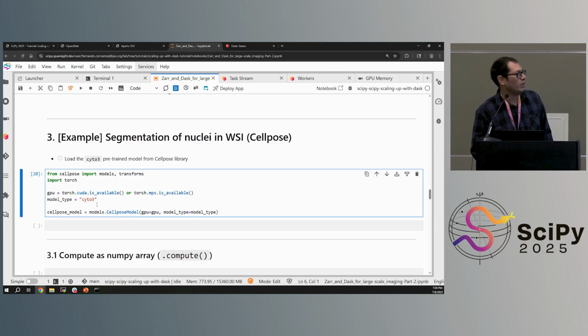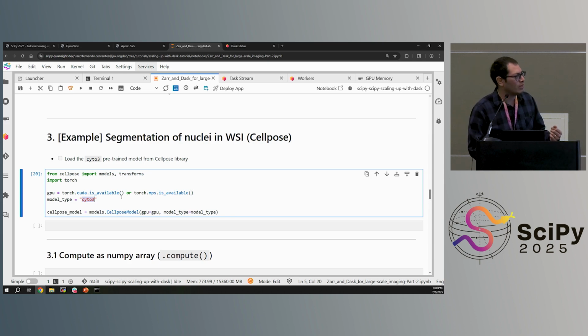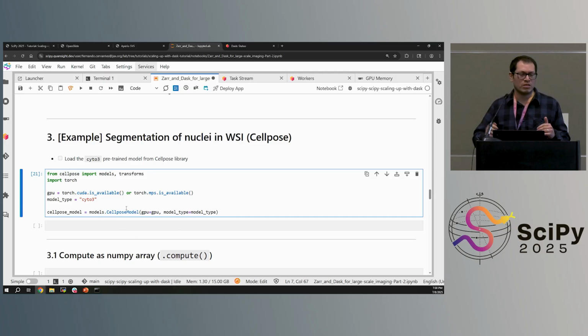The challenge here would be to define some thresholding method that could take your chunk and then apply something that usually is not defined in the Dask image. So that would require applying this lazily. For that, it would be using a multi-Otsu thresholding method that basically takes your grayscale image and then computes multiple threshold levels that could separate the levels of intensity in that image.